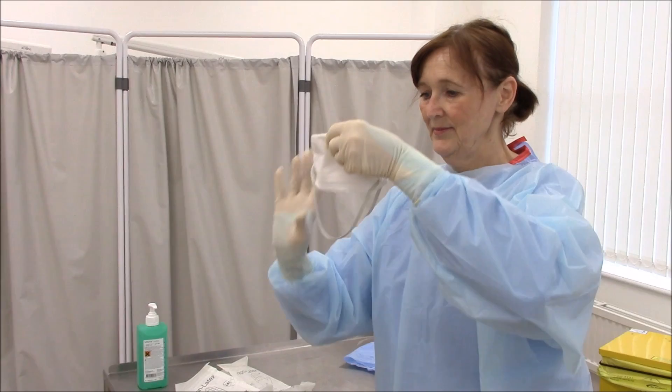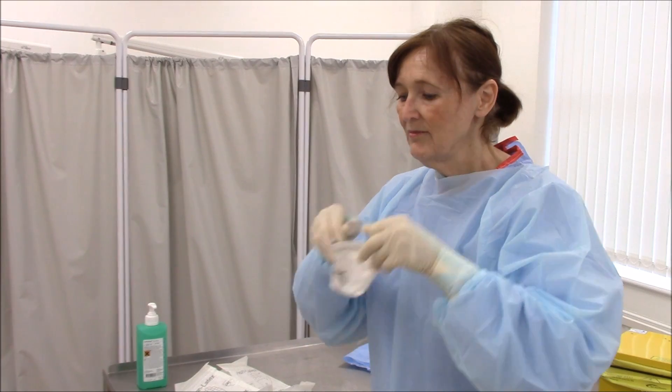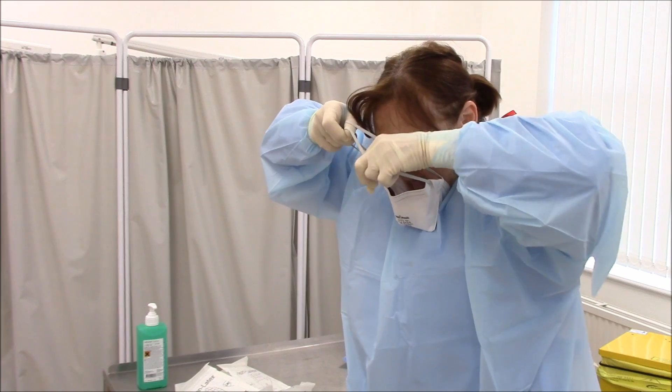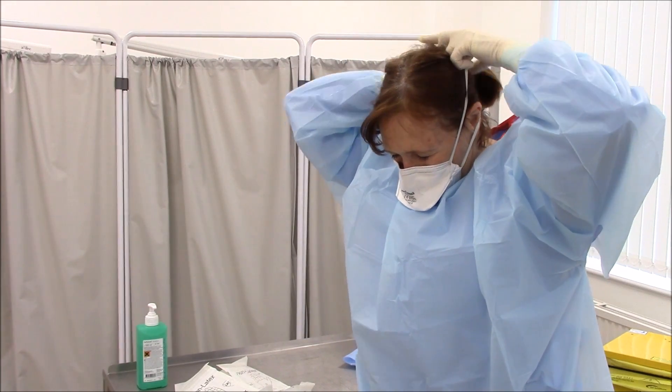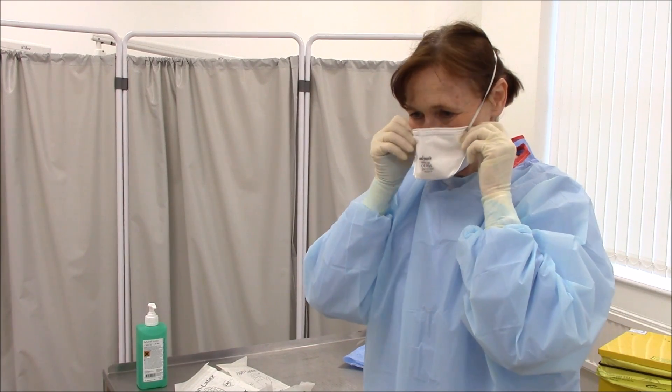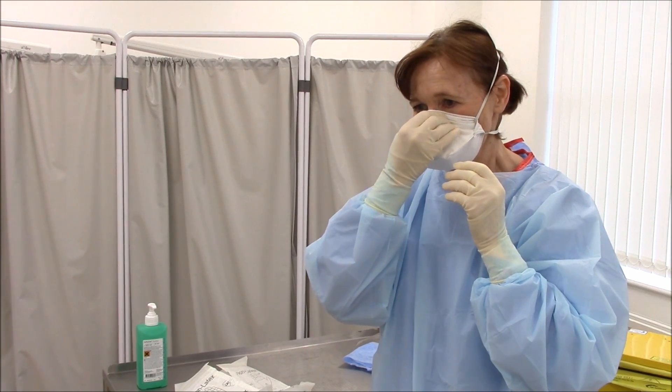Don the FFP3 mask. Secure the bands behind and on top of your head. Fit the flexible band to your nose bridge, fitting it snug to your face and below your chin. Fit check the respirator by inhaling and exhaling rapidly to check the seal.